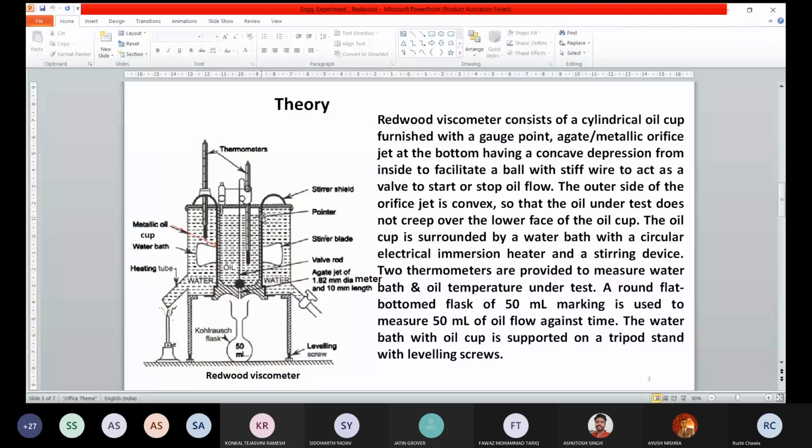Actually, this whole device can be dismantled. You can see that in the video. In the simplistic way, there are only two concentric circles and you place them one by one. Means you place the stirrer shield, the whole device that will introduce the stirring mechanism into the apparatus, between the two cups. It is somewhat separated, and in fact you can say it is the third concentric circle that will enter between the two cups.